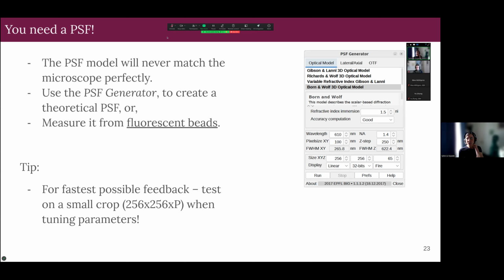Are there any more questions for Eric? I have a question. I'm using a single point confocal with an area scan detector, and I recently tried the new Zeiss software.